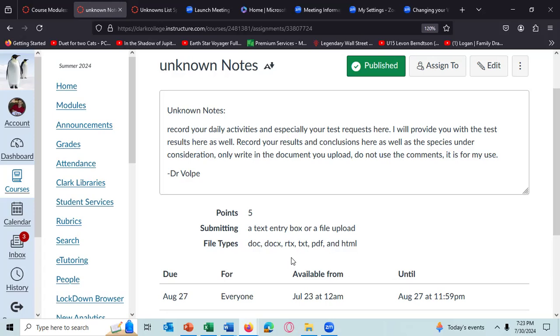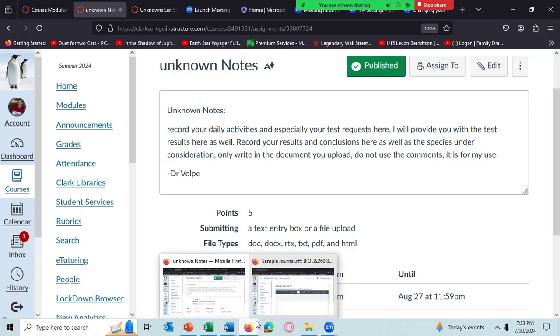Okay, I'm looking at the instructions. So when it says phase one isolation, in this document where you're writing the unknown notes, we email you, asking you basically to isolate it and you start doing the gram stain and the positive smear. So it's a back and forth, if I'm understanding this right?